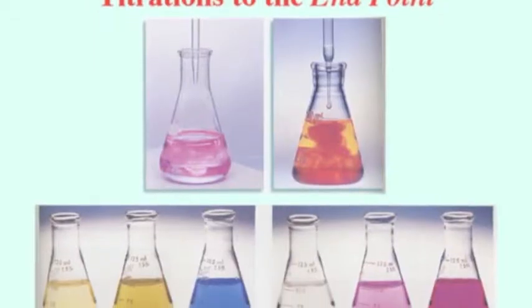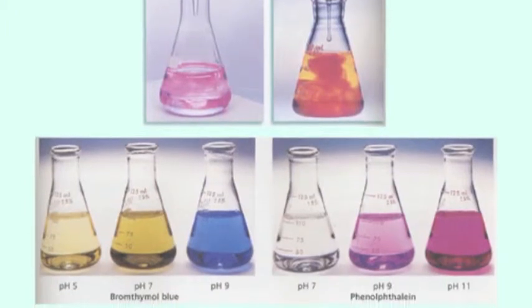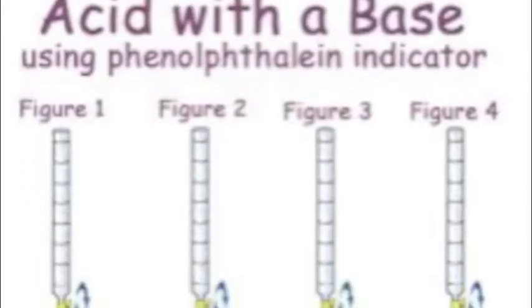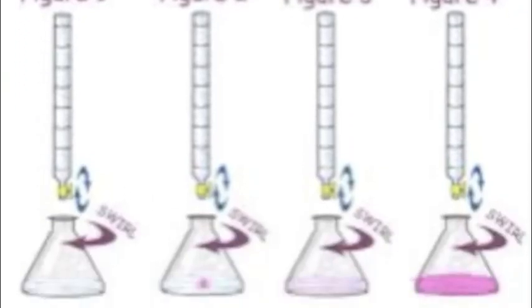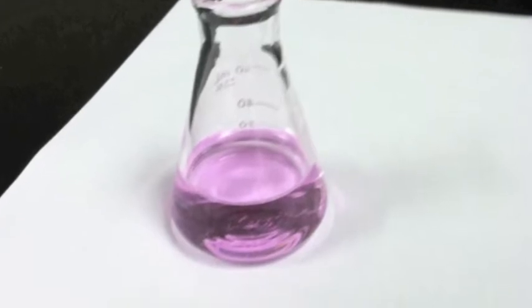The titration of acetic acid lab was performed to discover the endpoint of titration. When performing the lab, we used the following equation to calculate the unknown concentration: volume of acid and molarity of acid, volume of base and molarity of base. The endpoint is indicated by the sudden and permanent change in color of the indicator used. In this case, the color that indicates the endpoint was a pale pink.